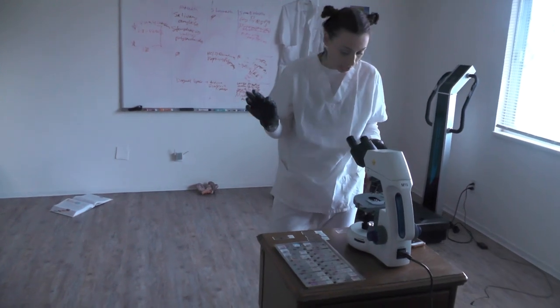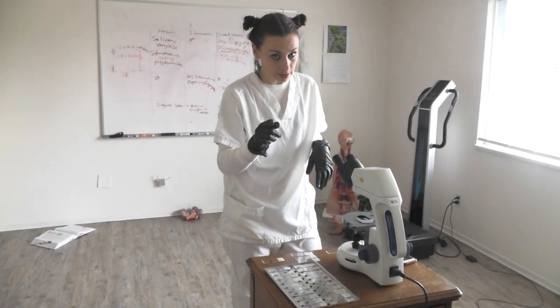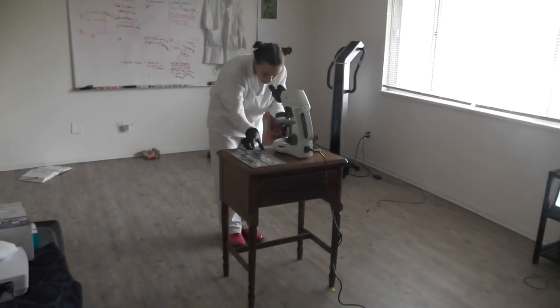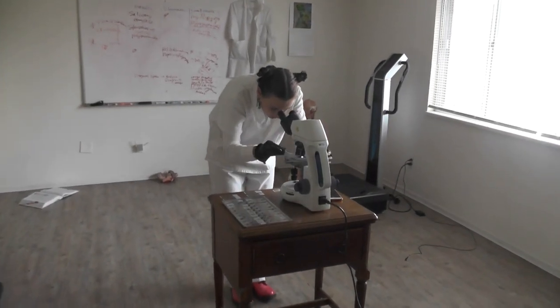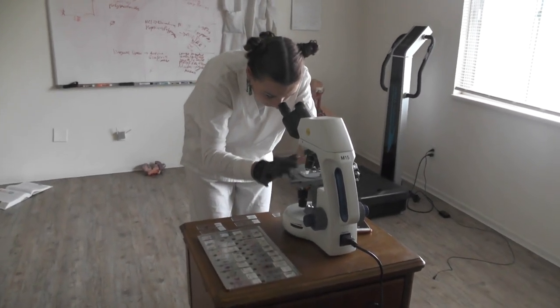Today's pretty hectic. They've got me doing heart, blood vessels, digestive system. So I'm going to show you the digestive system. I think in the digestive system, we'll just start at the esophagus and work our way down. We'll finish up with the accessory organs.